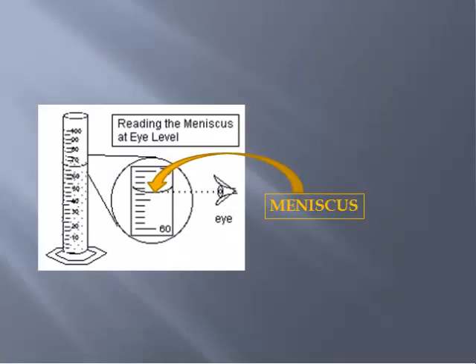One other thing: whenever you're reading the graduated cylinder, the sides of the cylinder tend to attract the water, leaving you with a concave water surface. We call this a meniscus. You need to read it at eye level, but you also need to read it from the lowest, or center point, of the meniscus.